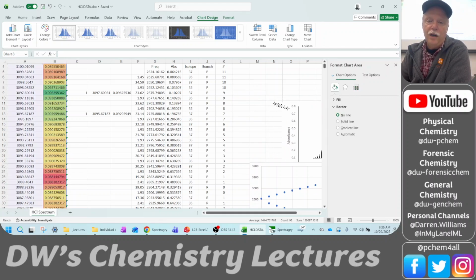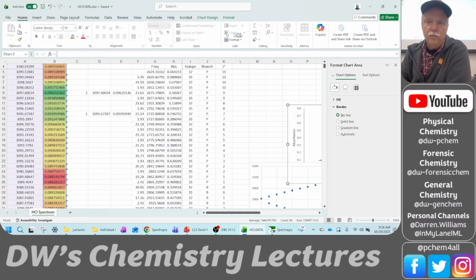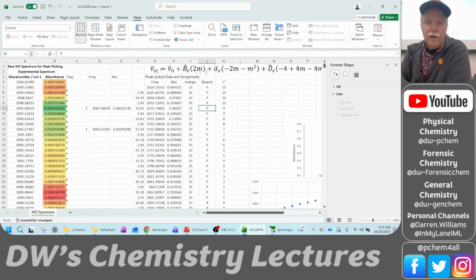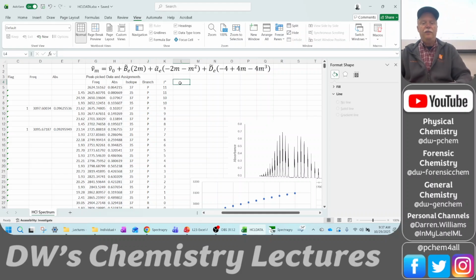Now we're ready to make our regression. So I'm going to come back up here to view and I'm going to unfreeze my panes. So that's on the home tab. No, it's on the view tab. Oh, here we go. View tab, unfreeze panes. So I can scroll up. So here's my equation that I'm going to do the regression on. And it uses this M quantum number, okay? So I've got to assign M values.